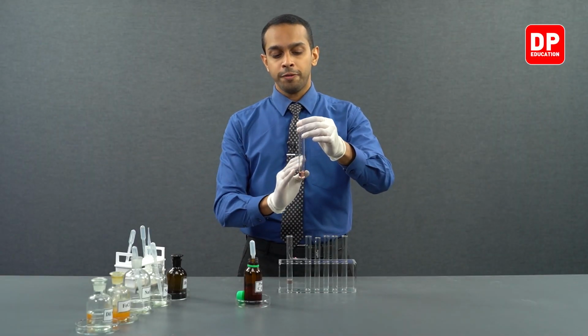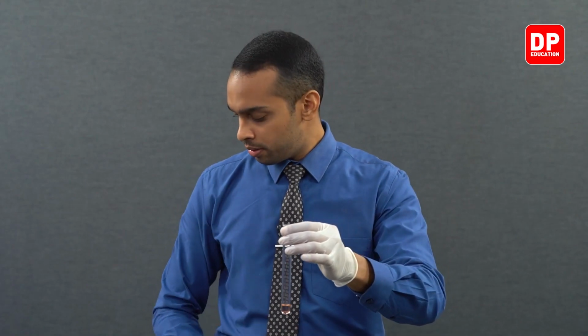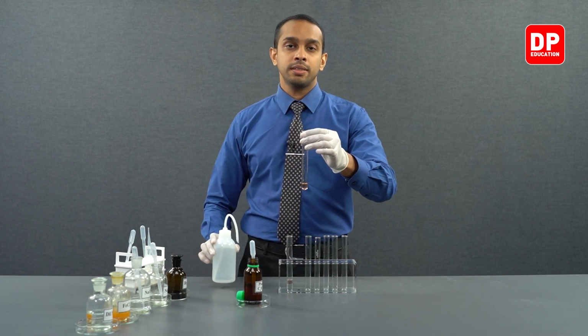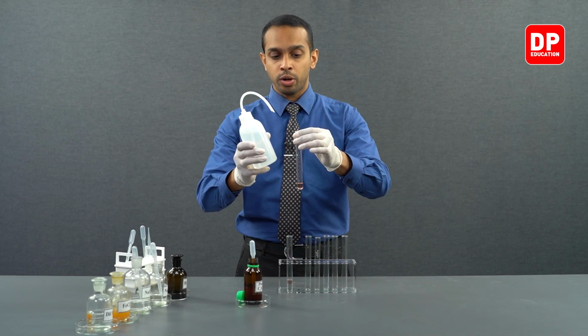And to our phenol sample here, let's add a little bit of water. We will add a small amount of distilled water with the help of a wash bottle.